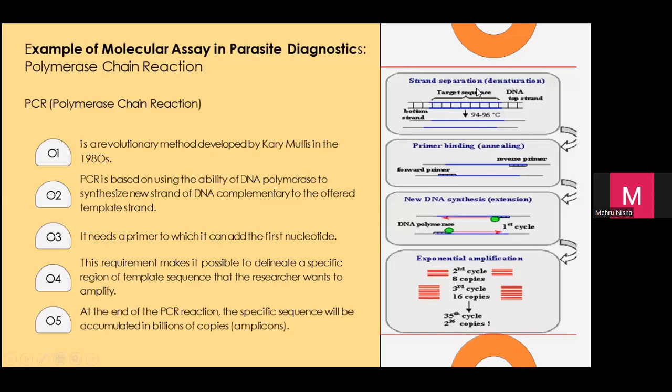You tengok kita, genome dia banyak. Tapi kita akan target, let's say sekarang saya tak pasti ini ascaris lumbricoides ke atau ini ascaris suum. So what I will do, saya akan ambil primer sequence, yang ni kita boleh dapat dari GenBank atau suruh industri untuk synthesize pada kita.